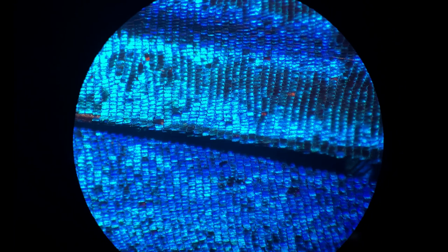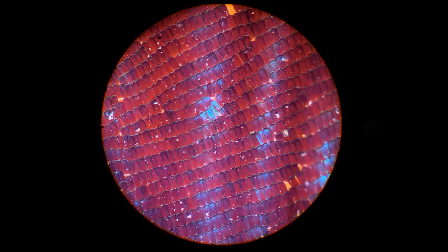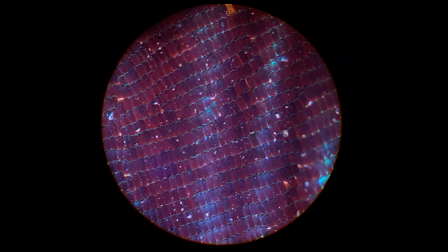Here's something that was very strange. On the compound microscope. Watch. See when I move the light around. They switch colors between brown and blue. This is the same spot. I was just kind of shifting that light around. I have no idea why. It must be the way that it makes that blue color. Or they reflect light.